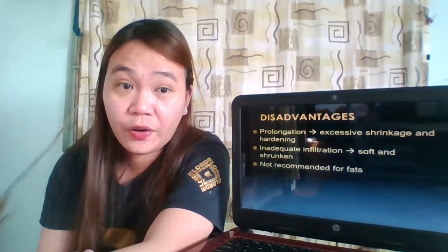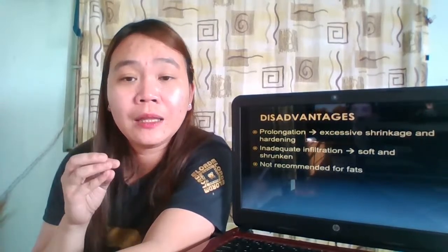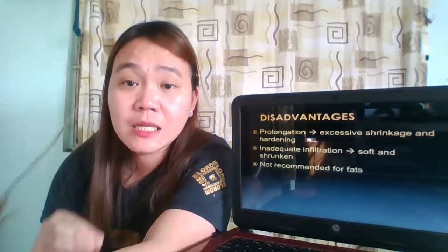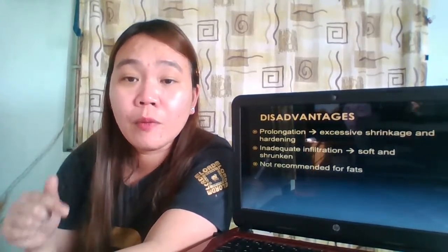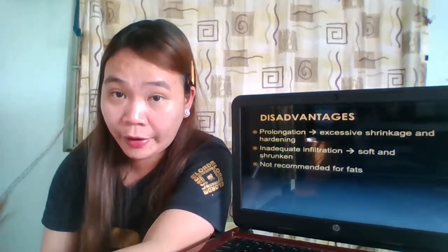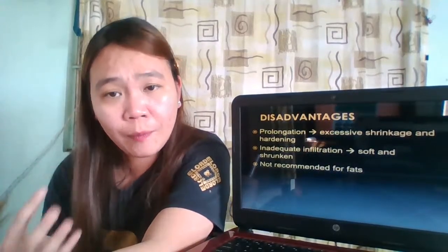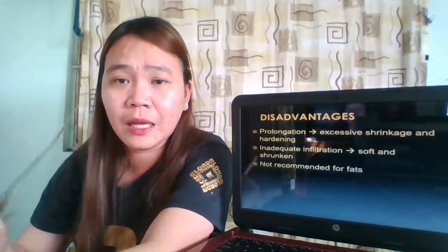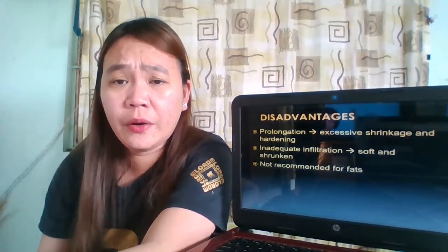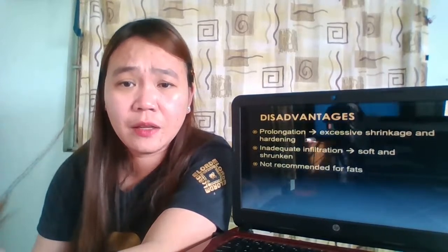So if infiltration is inadequate, it means that you did not remove the clearing agent completely from your tissue sample. And if that would be the case, what will happen if you are going to infiltrate it without completely removing your clearing agent, or if the clearing agent is still present in your tissue sample?